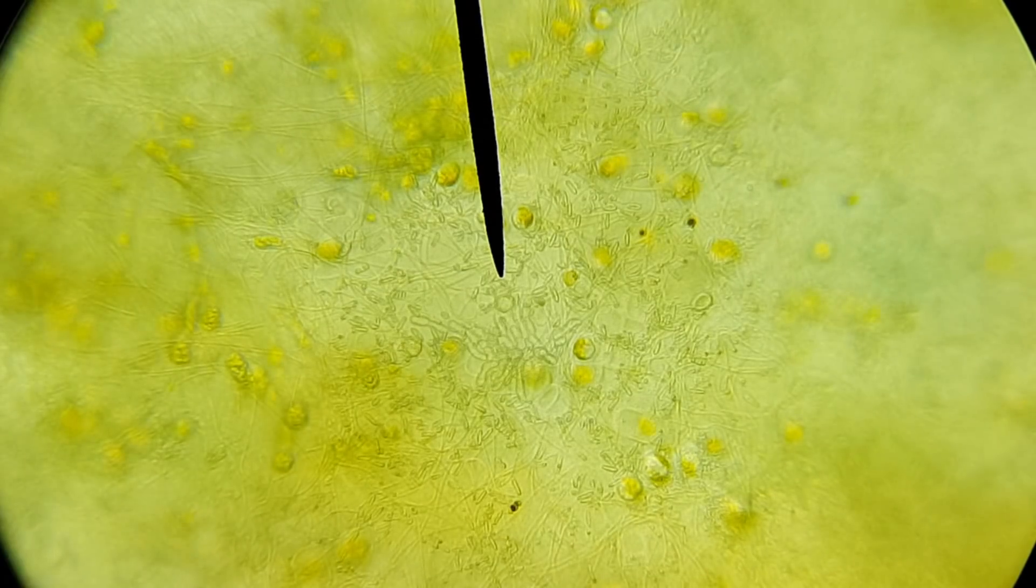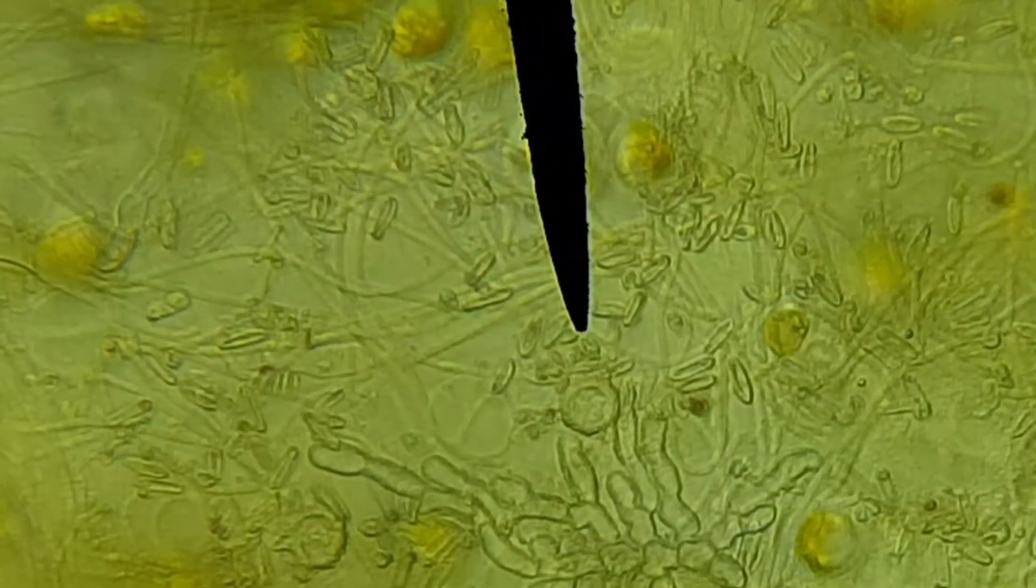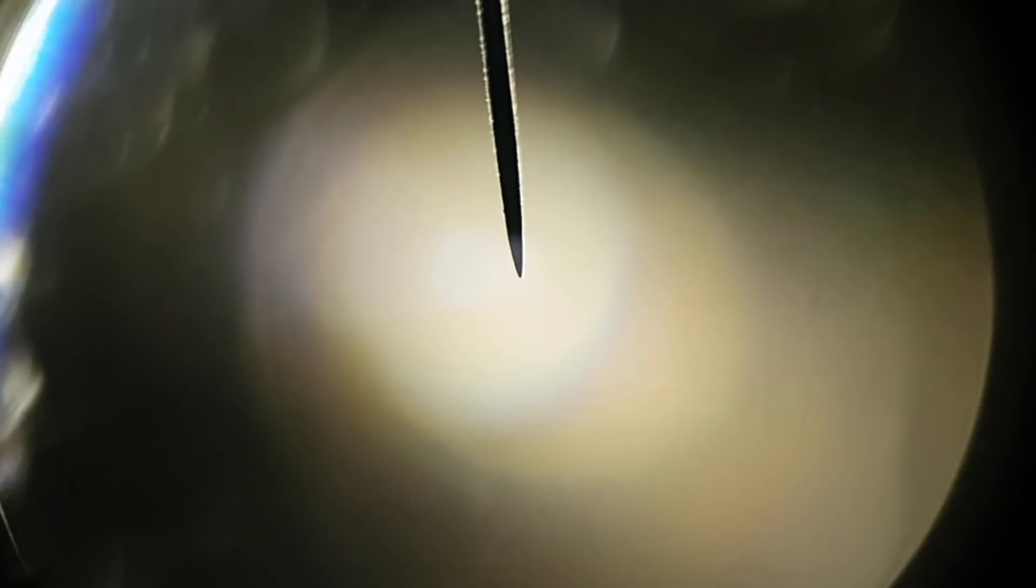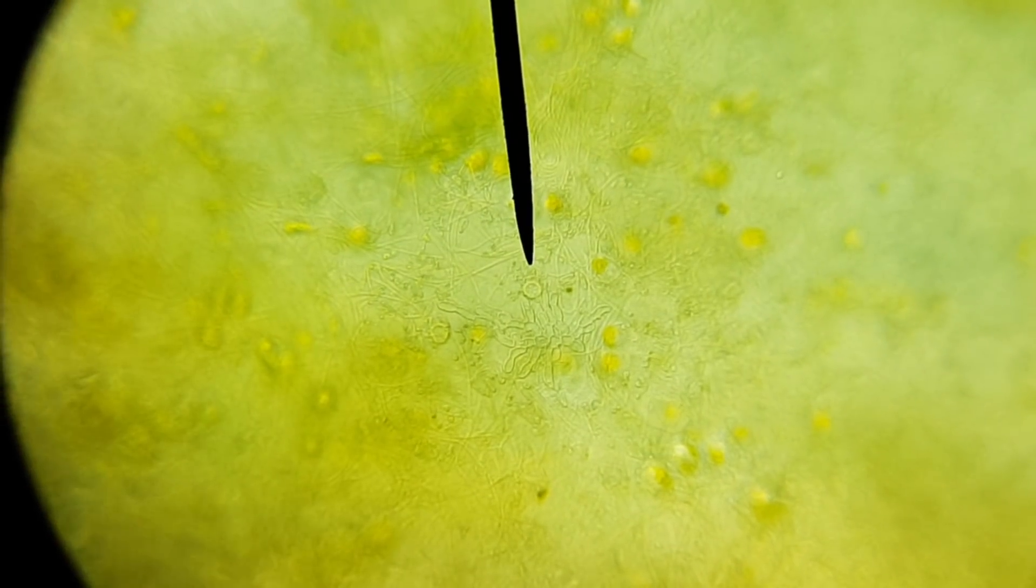I'm also seeing a lot of these structures. Let's do some digital zooming, which is of course very sacrilegious, and see if that makes it better. And here we go. I guess I deserved it. Never mess with optics. Let's see if we can find some more.